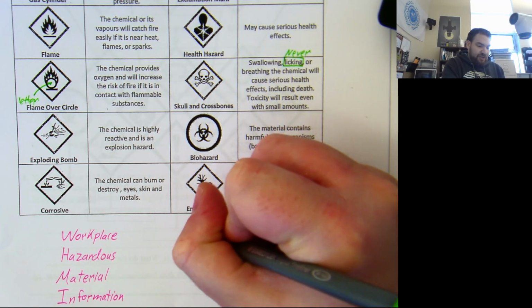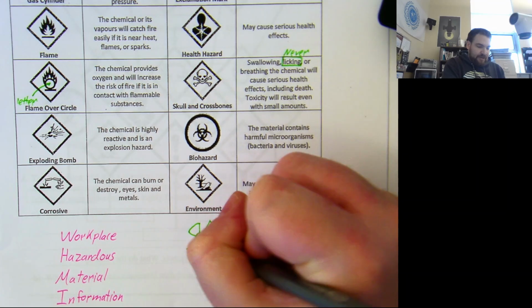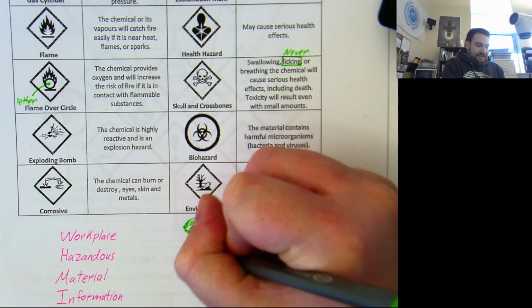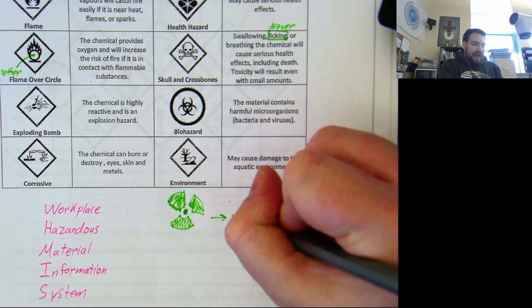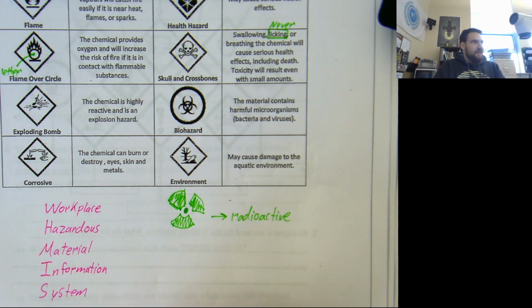It's kind of got a wedge, and then another wedge, and then another wedge. They're all supposed to be the same size. I'm not doing a very good job of that. This is another one that exists. It means that whatever you have is radioactive. We'll talk about what that means when we get to the physics unit, for those of you who have never looked at it before. Nothing we have in the lab that you guys will be using is radioactive. We do have some radioactive stuff, but you're not allowed to play with it for obvious reasons.